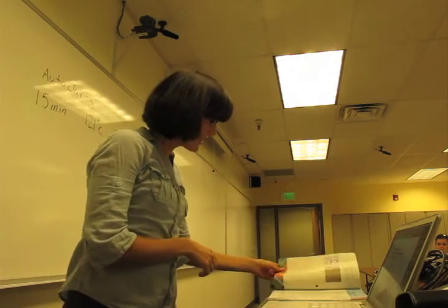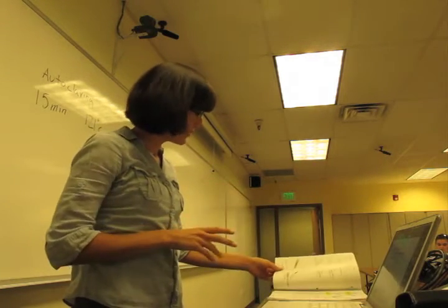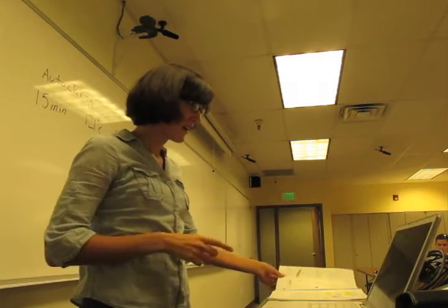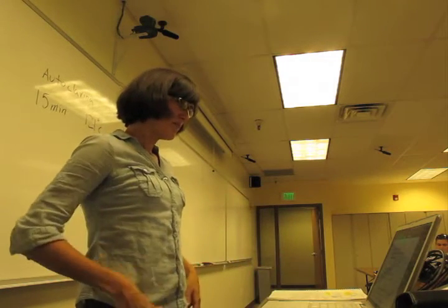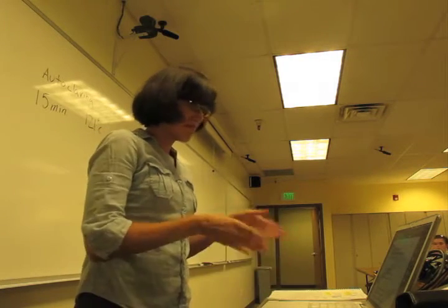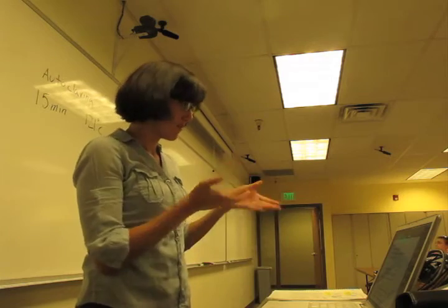In this lab, it was with heat. The book talks about chemical fixation, but since we didn't do that in lab, he's probably not going to ask you about that. So I would know just about heat fixing and why you do it, which is that it fixes the sample to the slide so it doesn't move around.